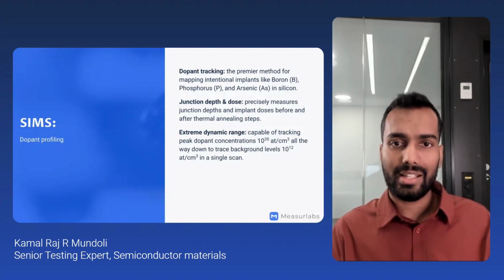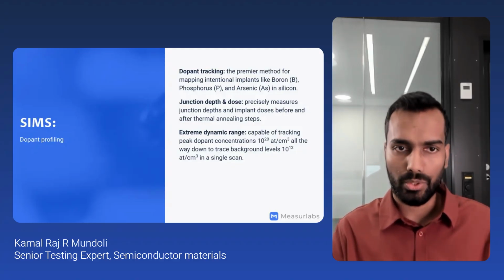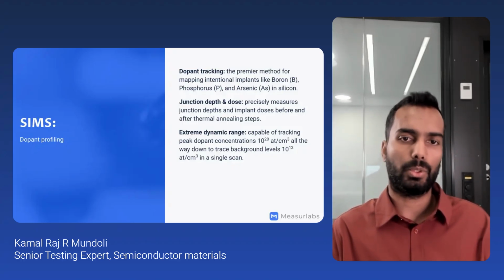So process engineers rely on this data to precisely measure junction depth and verify implant doses, comparing the profiles before and after different thermal annealing steps to monitor diffusion.